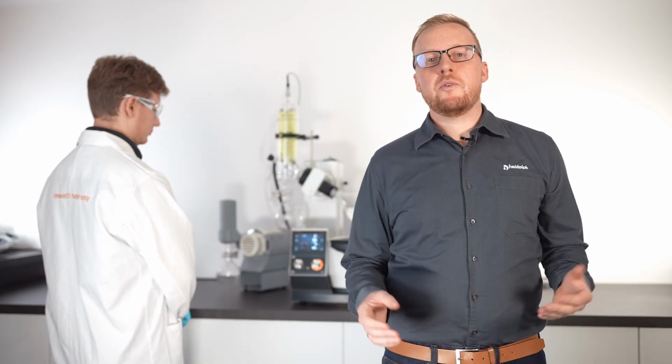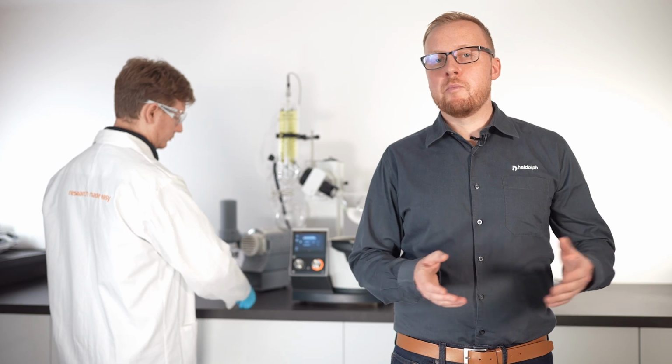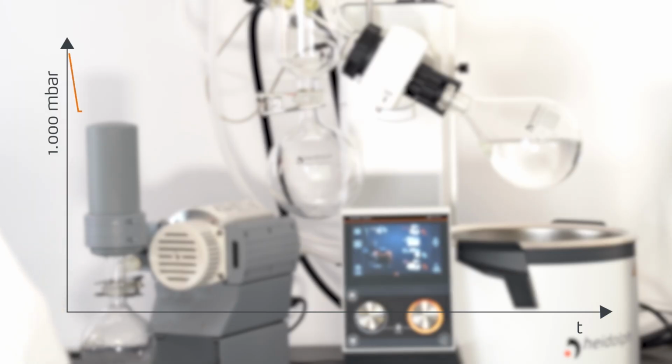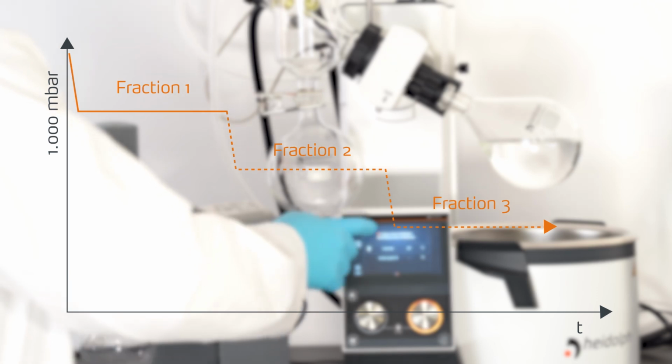But the DAA mode offers even more functions. For example, you can evaporate even multiple solvents one by one out of a complex mixture. This helps to avoid the chaos of foaming and bumping inside of the glassware system, which could occur if you address different boiling points at the same time.